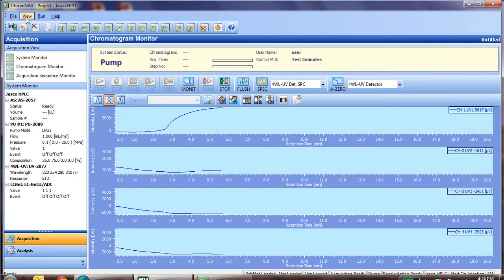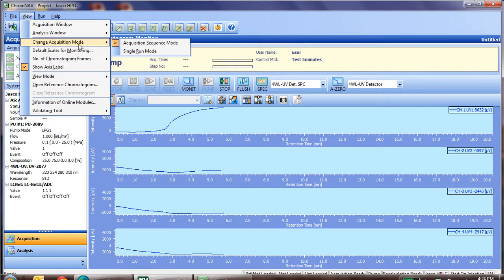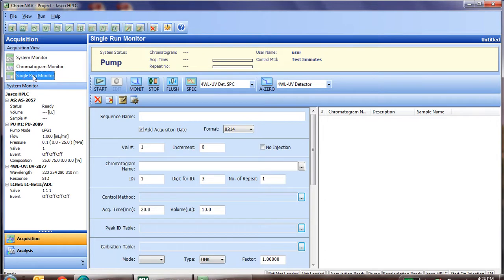To do a single injection, go to View, change the acquisition mode, and change it to single run, or confirm that it is already in single run mode. Once you're in single run mode, you'll notice one change. The third view is now called Single Run Monitor, as opposed to Acquisition Sequence Monitor.